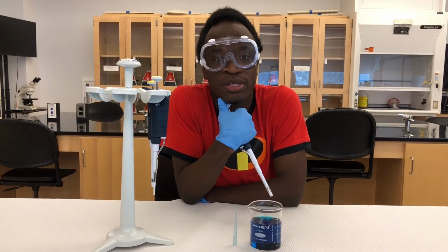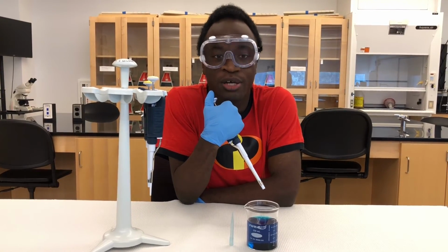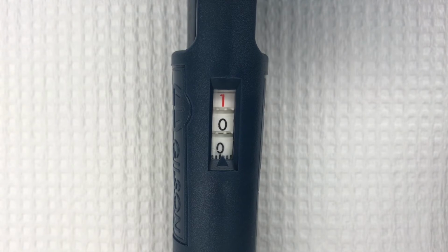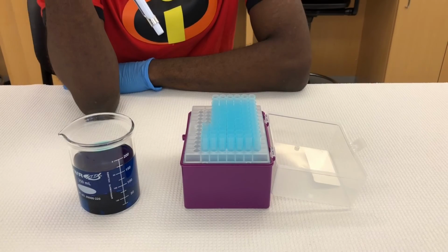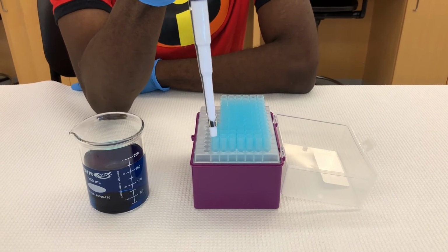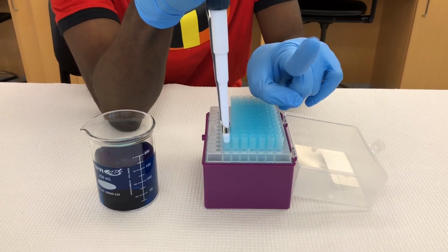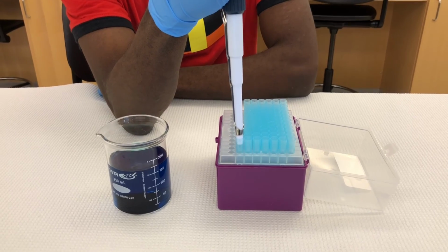Now some important reminders. Never use a micropipette without a tip attached. Liquid will enter the pipette, causing corrosion and contamination. Do not adjust the pipette beyond its volume limits. The volume will not be accurate and you may damage the pipette. To properly attach the tip, gently but firmly insert the micropipette into the tip. Do not bang on the tip while trying to attach it to the micropipette. This can damage the pipette.